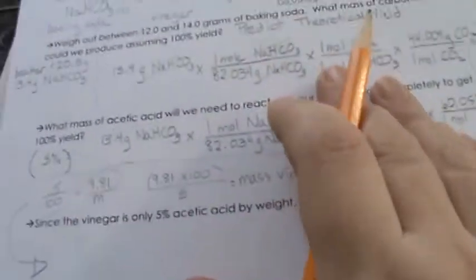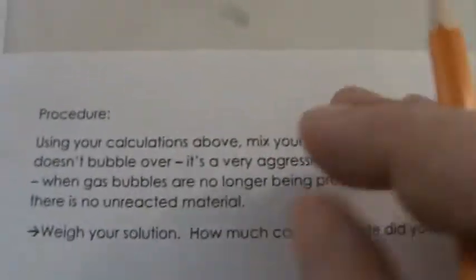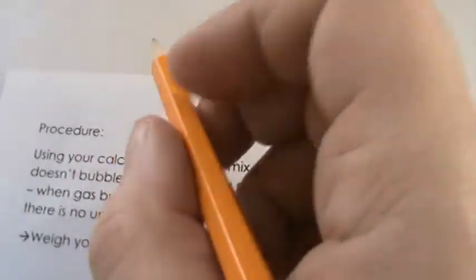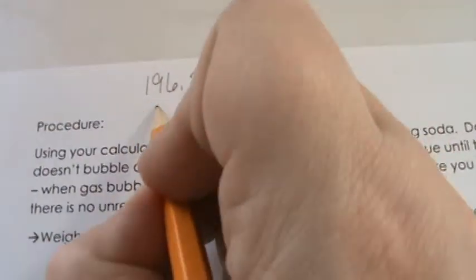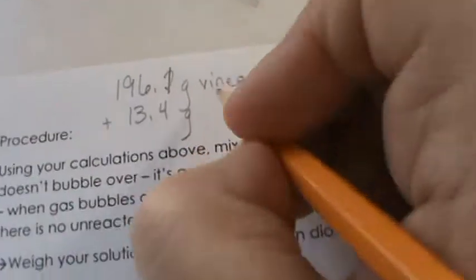And while this reaction is finishing, let's come over here and do a little bit of a prediction. Okay, so remember we had that law of conservation of mass. So we had 196.1 grams of our vinegar, and we had 13.4 grams of our baking soda.